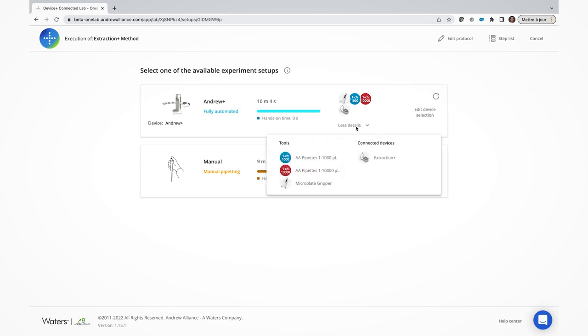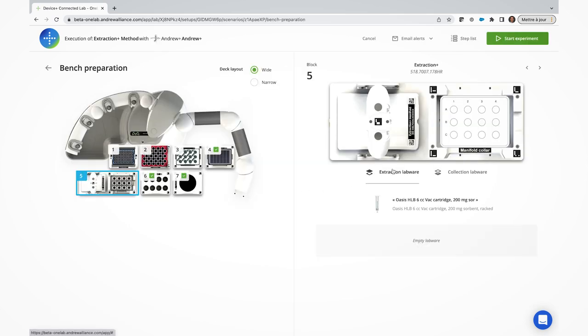While Extraction Plus can be a standalone device, it truly shines when combined with the Andrew Plus robot, enabling full automation of complex SPE workflows.